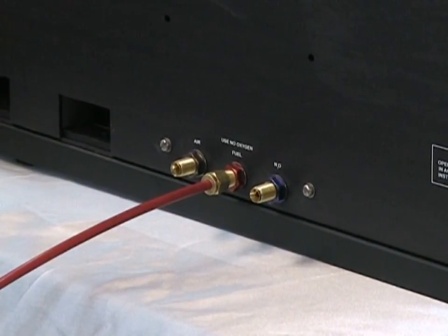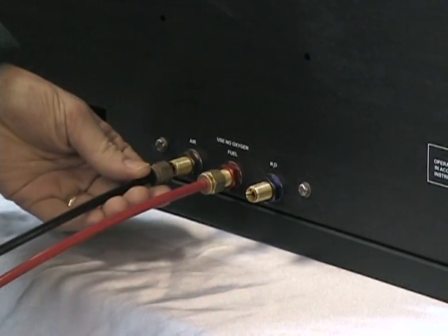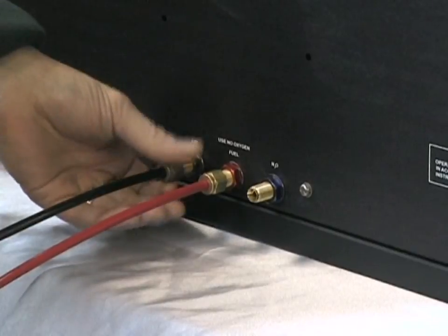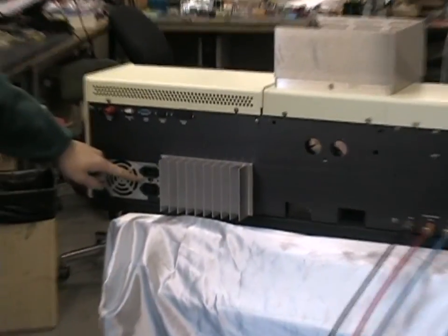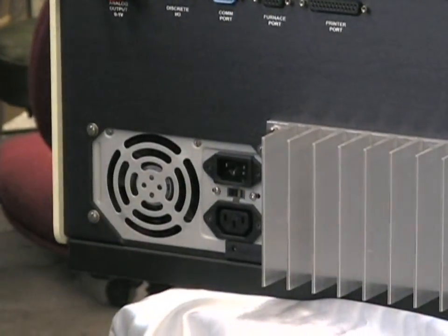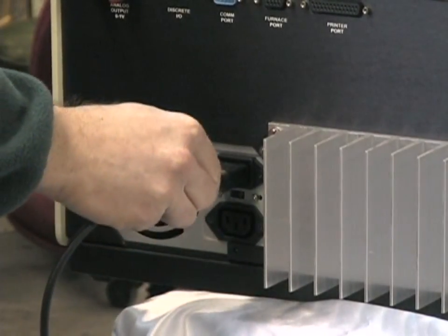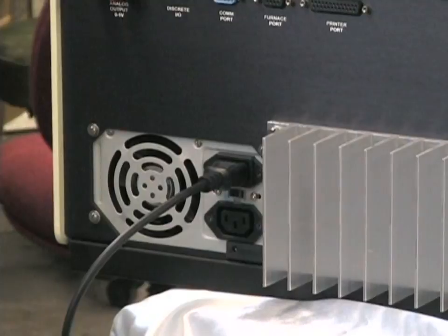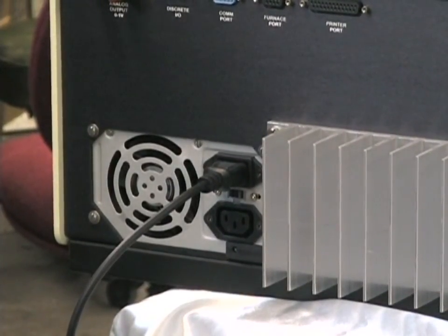Repeat this for the other lines and we will proceed to install the instrument on the laboratory bench. Before connecting your electrical power cord, make sure the little voltage selector switch is set for the proper voltage for your operation, whether 110 volts or 220 volts. Plug in the standard electrical instrument connector, and we are ready to transfer the instrument to our lab bench and prepare it for analysis.